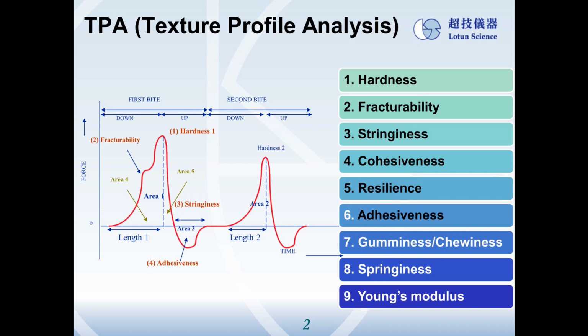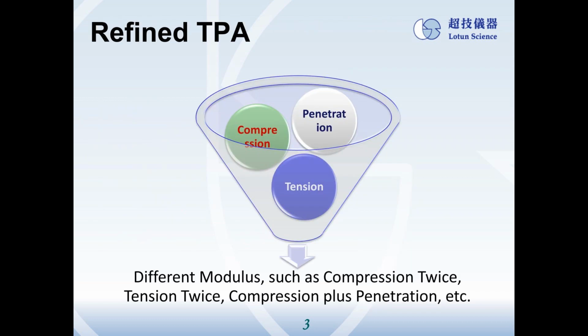Here we develop a protocol which we call Refined TPA to conduct both non-destructive and destructive analysis through new fixtures and adjustable testing conditions using programmed modulus.